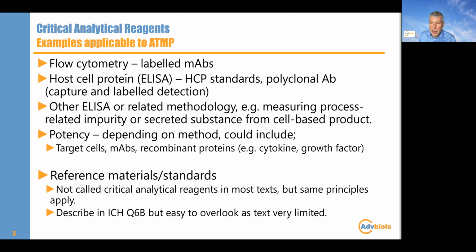But other ELISA-type methodologies, you might be using that to measure process-related impurities, or you might be using ELISAs to make some measurements of cytokines from cells in process or as part of a potency assay.